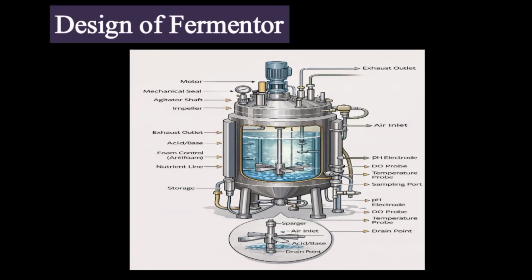So this is a design of a fermentor. The fermentor vessel contains a motor, mechanical seal, agitator shaft, impeller, exhaust outlet, and air inlet. It contains acid and base, foam control agent that is anti-foaming agents, and nutrient line, storage, pH electrode, exhaust outlet, DO probe that is dissolved oxygen probe, temperature probe, sampling port, again pH electrode, DO probe, temperature probe, and drain point that is harvesting port.